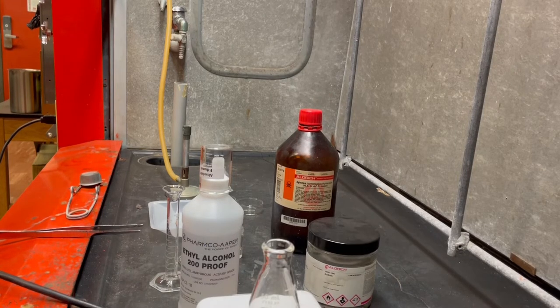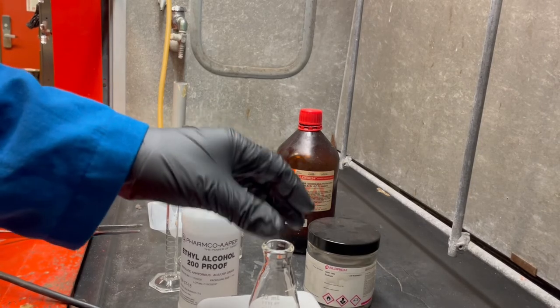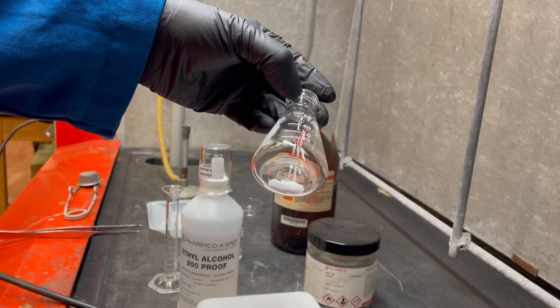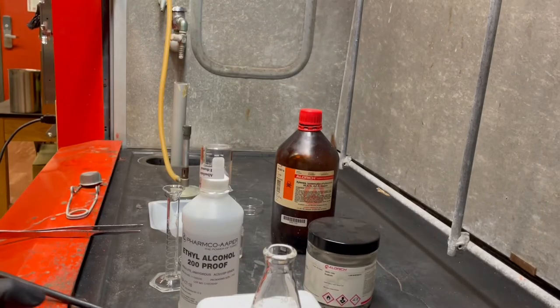All right, so the first part that I'm going to do is preparing the sodium ethoxide. You actually don't get to do this in the lab, and you don't ever get to see how it's done, so this is a great opportunity, one of the benefits of being online. What I'm going to do is use this 50 mil Erlenmeyer flask. You can see the round stir bar in there. It's still hot from flame drying it.